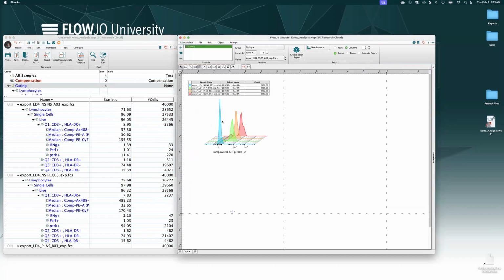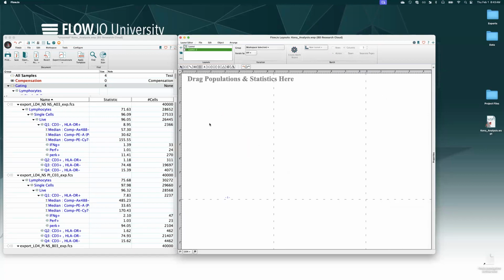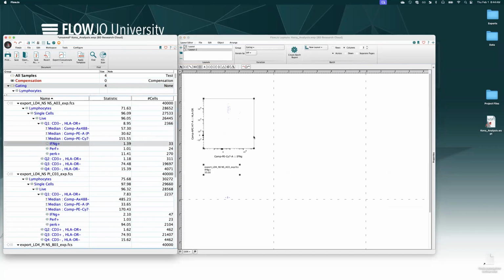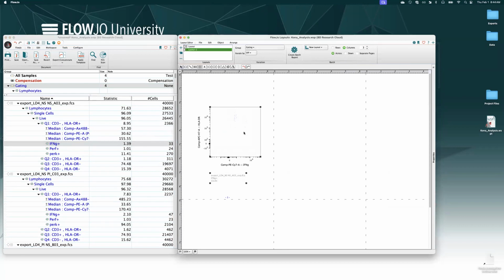This one, I only have the 4 samples, so there's not really any additional batches to run through at this point. But if I loaded in more files, I could, or I could always create another type of overlay or plots here showing.